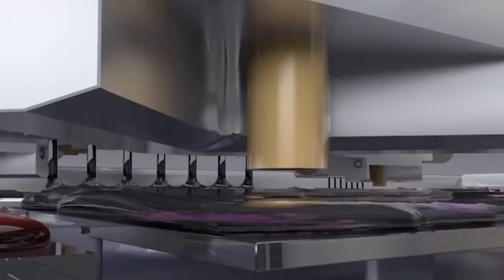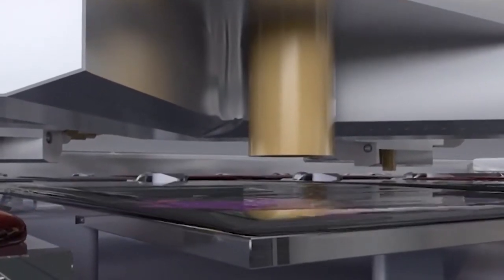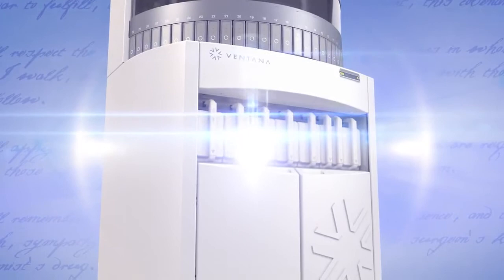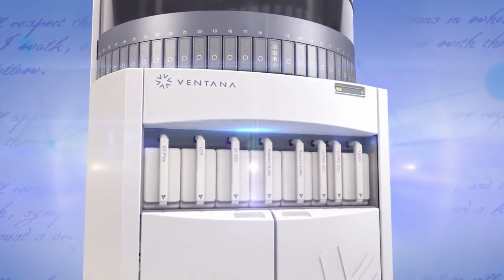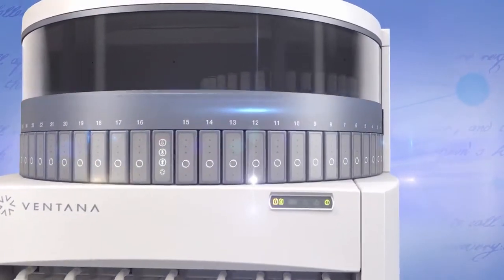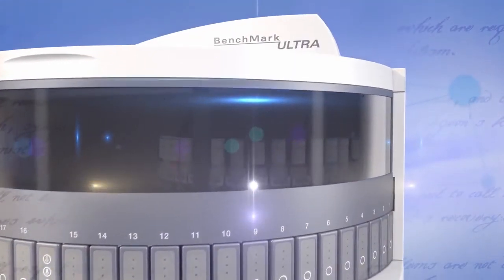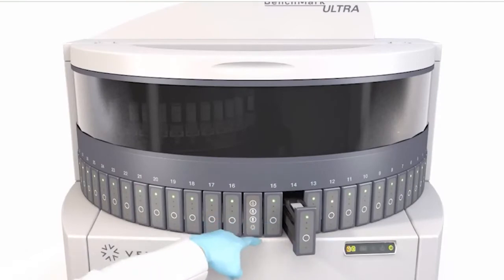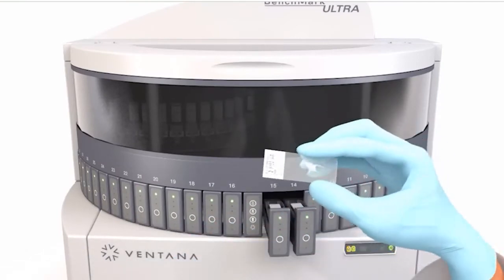We are tasked with creating a system or tool that can measure the volume of liquid dispensed onto a microscope slide. This slide will be placed within the Ventana Benchmark Ultra, which is an automated tissue staining instrument that has individual slide drawers that allows the user to stain multiple slides.